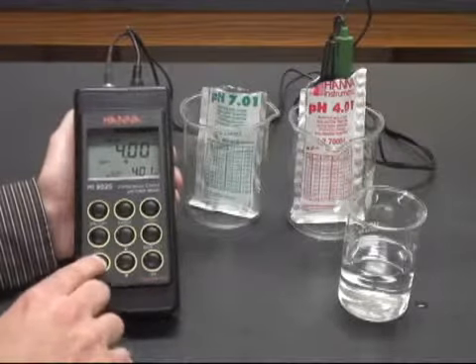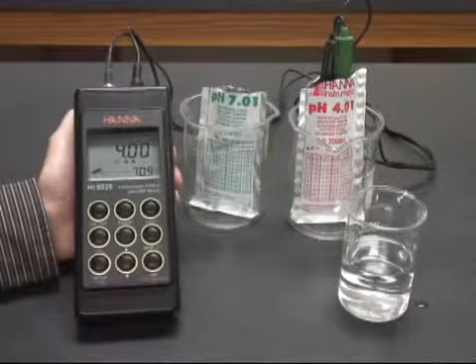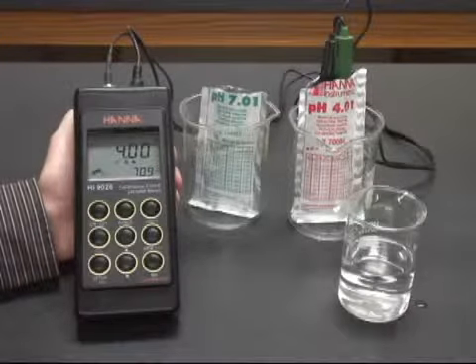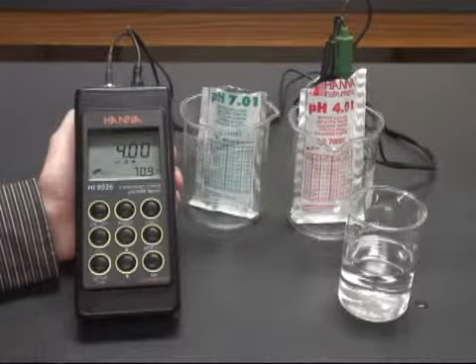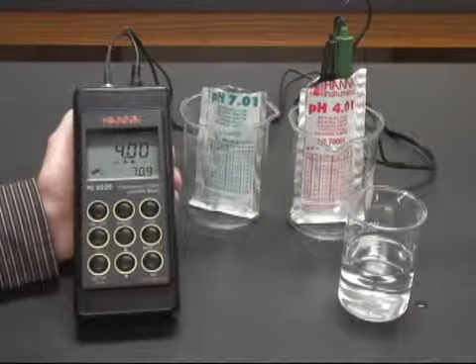You hit confirm again. You'll see your meter move into measurement mode, displaying the temperature, and you're good to go. You are now ready to measure pH. Thank you.